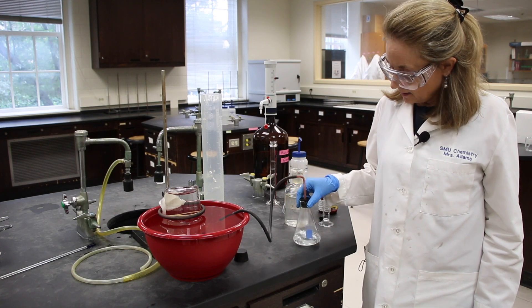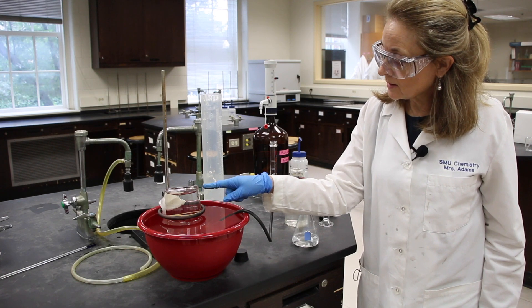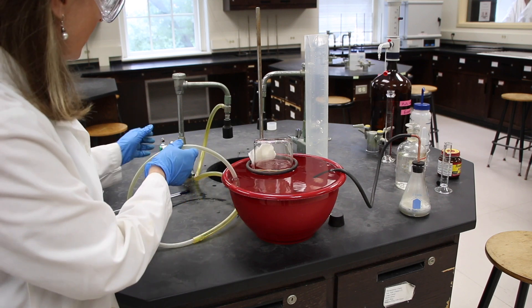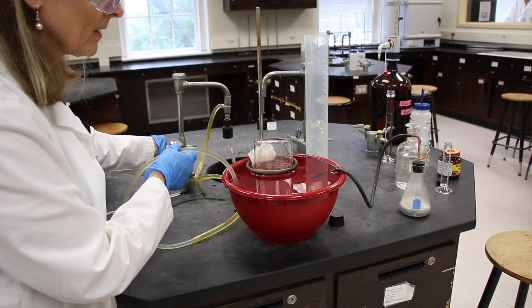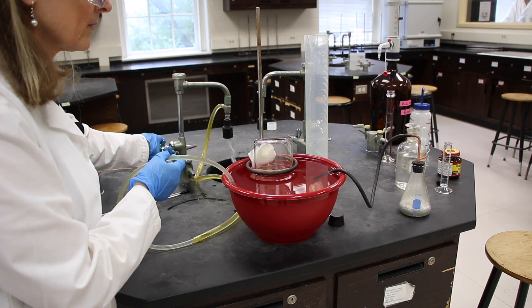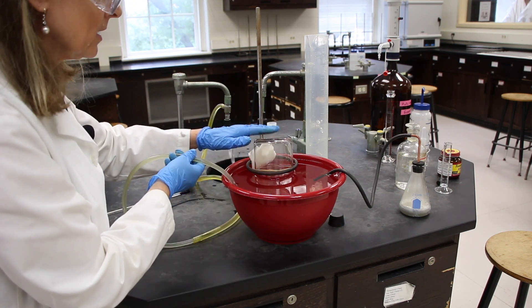So now is a good time to do the calculations for the first part of this experiment. After about 15 minutes, the aluminum is starting to react with the hydrochloric acid. You'll see some generation of hydrogen in our collection bottle, and this whole reaction will probably take at least another 10 to 15 minutes. It looks like our volume in the red bowl is getting kind of high, so let's turn on our aspirator and take down the volume a little bit. You can also see that we've got a pretty active reaction going in our flask, and the hydrogen is bubbling into our collection bottle.